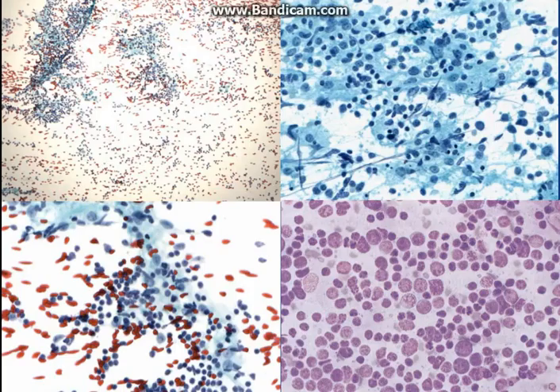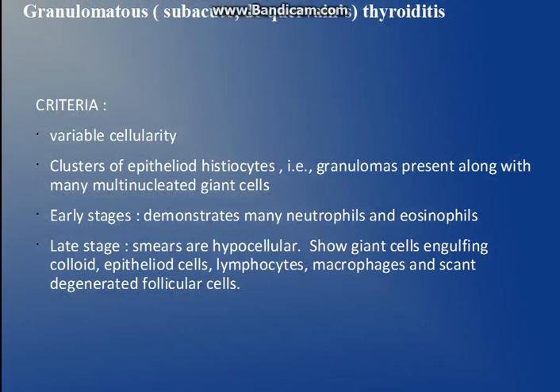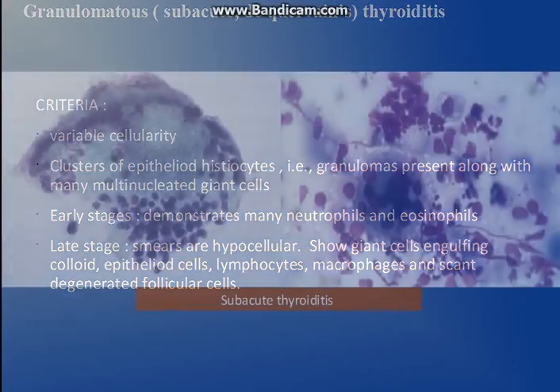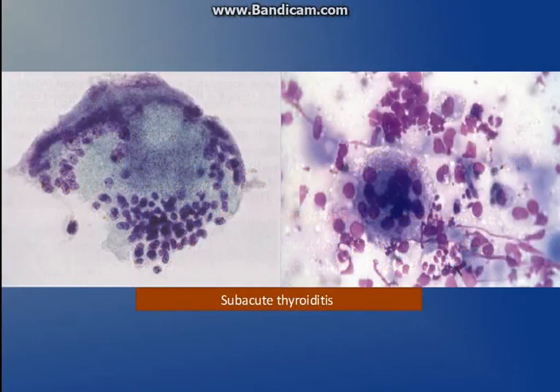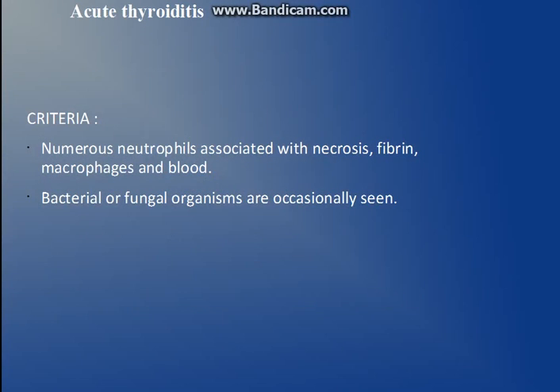This picture shows lymphocytes and follicular cells intermixed. Then granulomatous thyroiditis — these categories also go into benign category 2. In this there is variable cellularity, epithelioid histiocytes are present, granuloma cells are present, and giant cells can be seen. This picture shows a giant cell. For acute thyroiditis, which also falls in the benign second category, necrosis, macrophages, blood with numerous neutrophils, and few follicular cells can be seen.